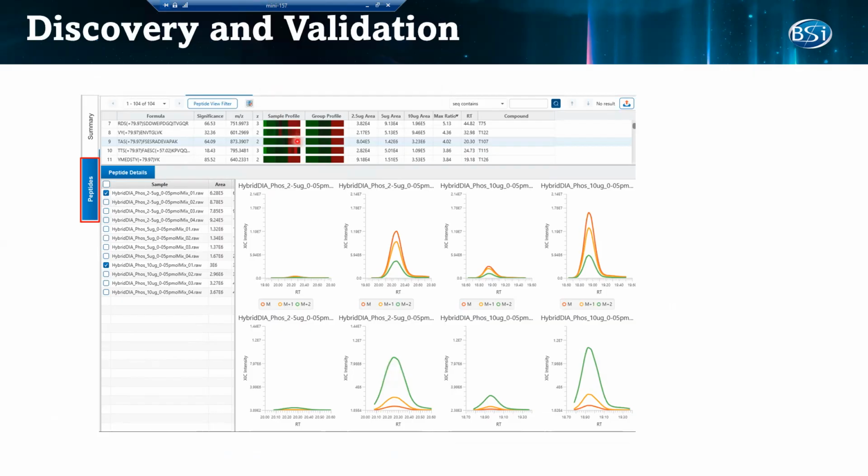For the PRM, we know that if we compare the PRM to the DIA, PRM will perform better in the quantification and the dynamic range. So we can see here for these peptides, this is the PRM part. The ratio should be, since this is 3 groups, 2.5, 5, and 10. So the ratio should be 1, 2, 4 here. So for this peptide, PRM gets a very good result. The ratio is close to our real ratio.